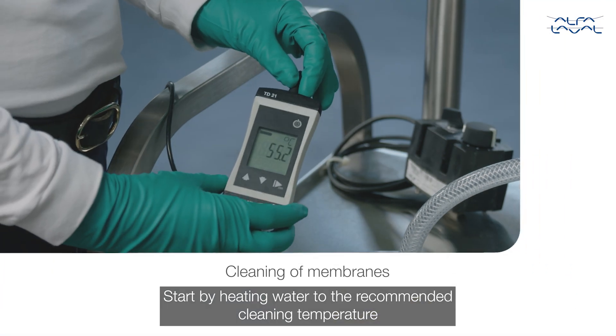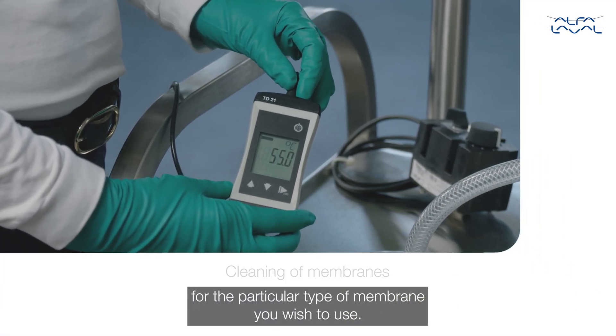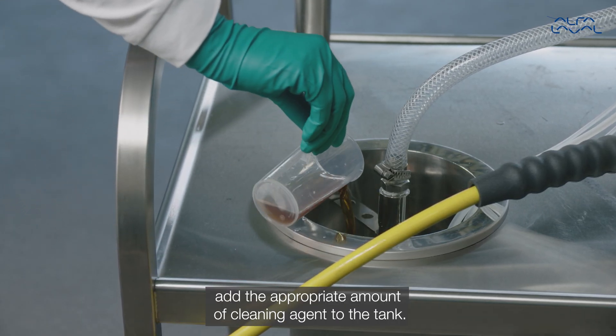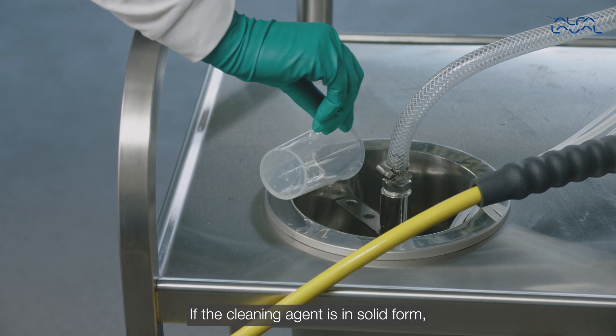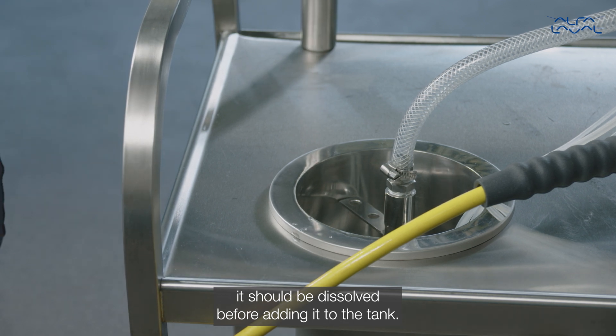Start by heating water to the recommended cleaning temperature for the particular type of membrane you wish to use. After reaching the desired temperature, add the appropriate amount of cleaning agent to the tank. If the cleaning agent is in solid form, it should be dissolved before adding it to the tank.